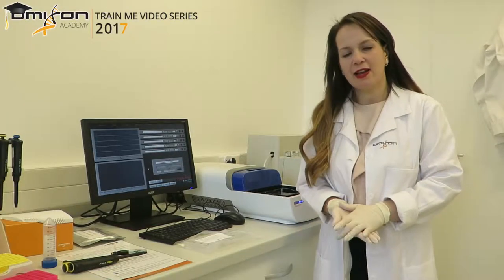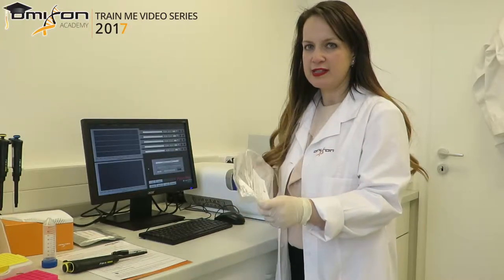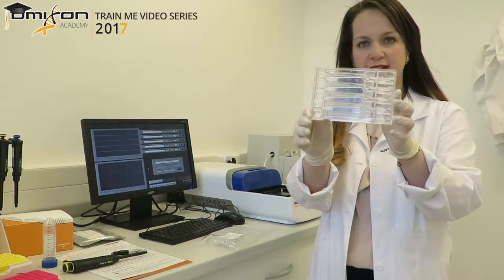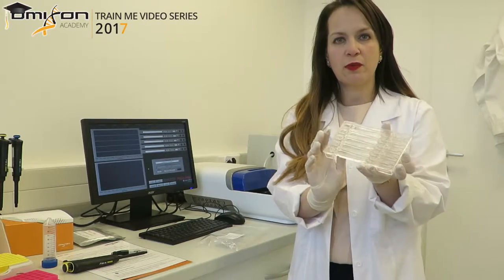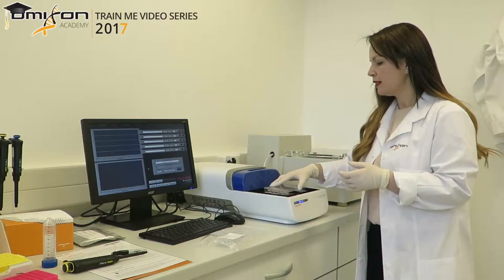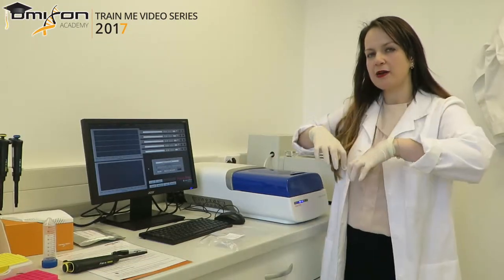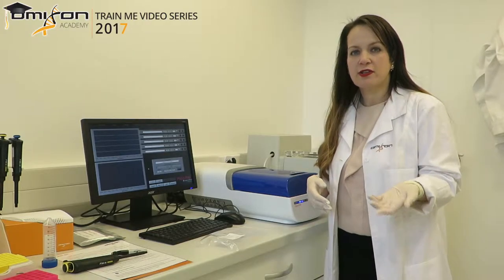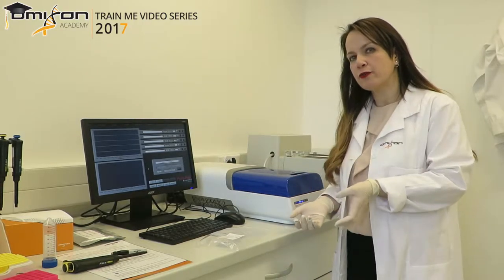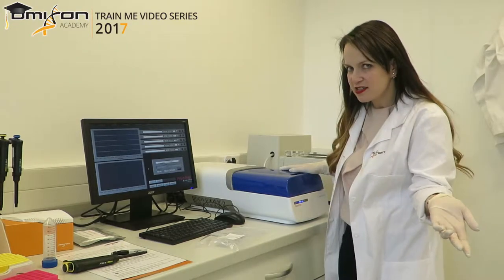Now that we have collected our size-selected library and put it on ice in a low-bind tube, we clean up the machine. The maintenance is very easy and quick. We take the cleaning or rinse cassette — it also comes with the machine and is reusable. It looks exactly like a regular cassette except it is completely empty with no agarose. We fill it with water — just MilliQ water — put it in the machine, close the lid, and leave it for 30 seconds. When you close the lid, the electrodes come down into the water and rinse themselves. Over time, excess salt can accumulate from the electrophoresis buffer, so it is highly recommended to do one clean at the end of each day.